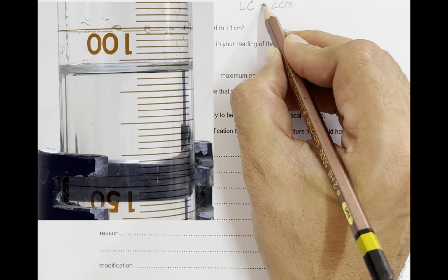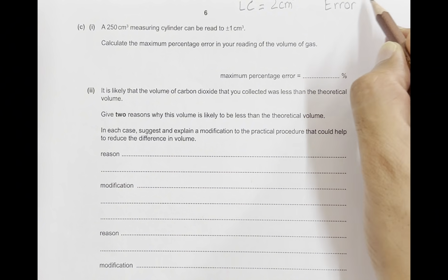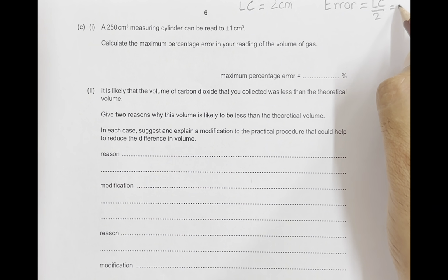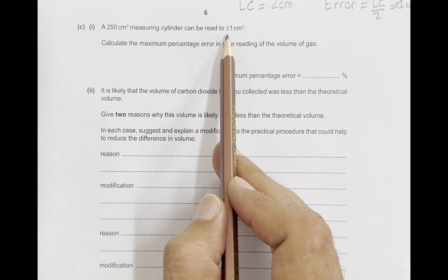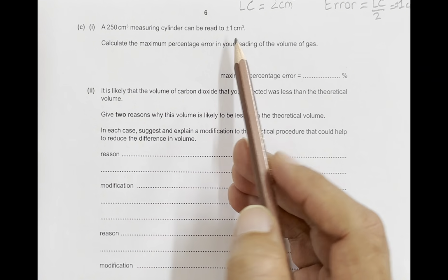So the least count is 2 centimeter cube. Therefore, the error is read at half of the least count. That means ±1 centimeter cube is the error. So the measuring cylinder 250 is read up to ±1 centimeter cube.